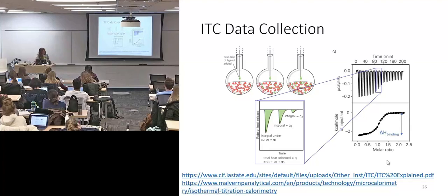And if our molar ratio goes through this point of 1, the slope in the middle of this curve, it indicates 1-to-1 binding. So once again, we can figure out the stoichiometry of our ligand to our protein. Does only one ligand bind that protein? If 2 ligands bind that one protein, we would see 2 as our ratio there.